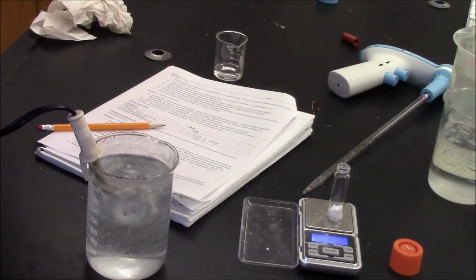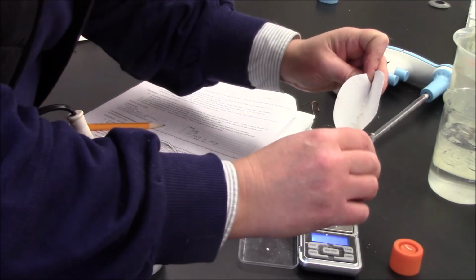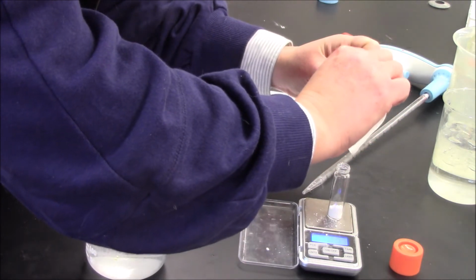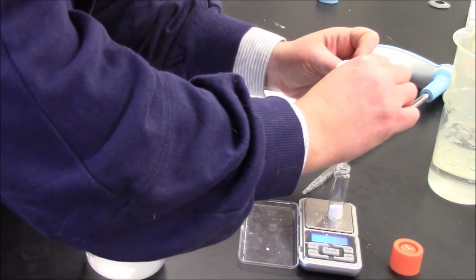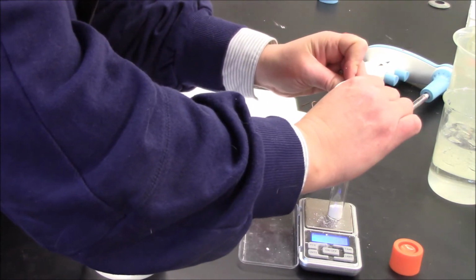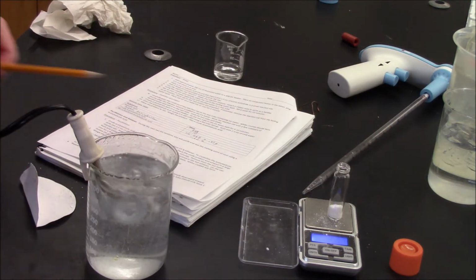Eventually, I do see a change in my balance, but that change is nothing compared to the initial mass of crude product that I had. Based on the mass of the crude product and the filter paper, and then the mass of the filter paper by itself, I estimated that I had recovered about 0.45 grams of my crude product. And at this point, my balance is really only measuring 0.07 grams of crude product, despite the fact that I've added almost everything off of my filter paper.